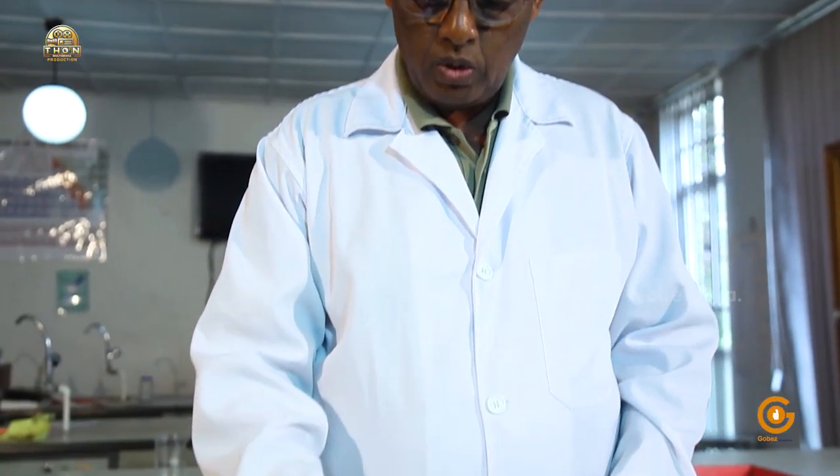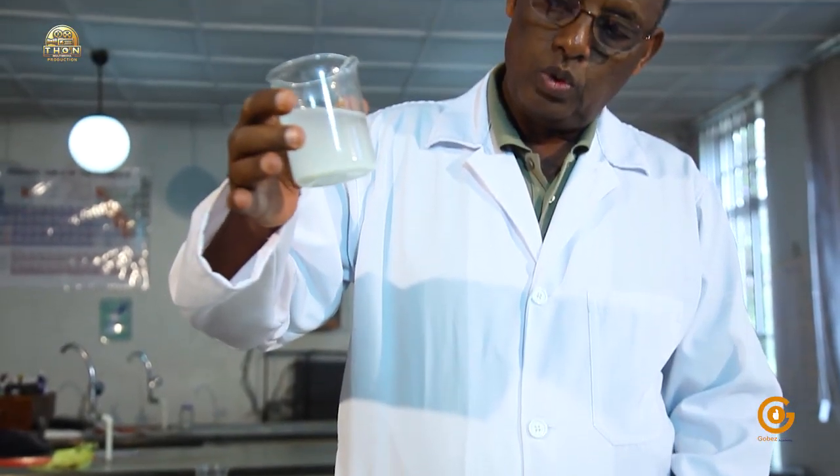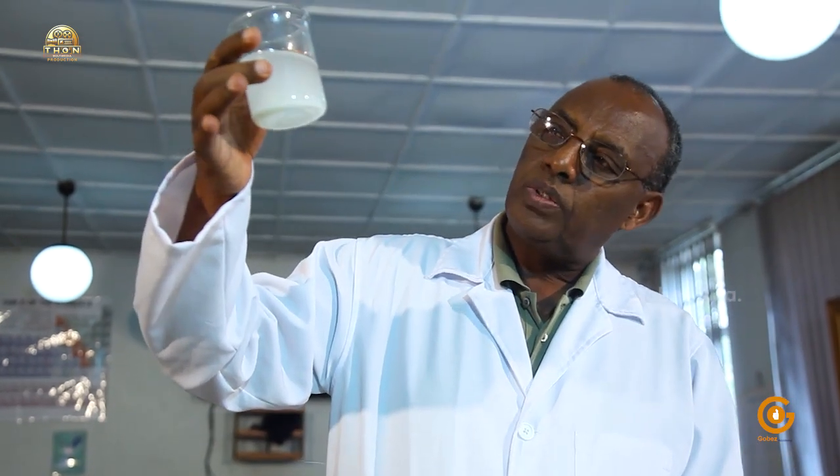With the last part of the experiment, what was done was to make this solution out of baking powder. It still looks cloudy. It has not settled down. We don't know if everything has dissolved yet.